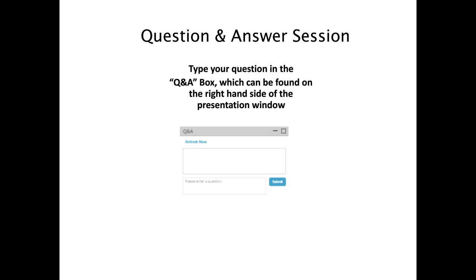Okay, here's our first question from the audience. What is the difference between currently tested biosimilars and a general approach to the popular antibodies? Well, thank you for the question. Thankfully, there's not such a big difference between generally large molecules and the popular monoclonal antibodies, which are basically the biologics of choice.